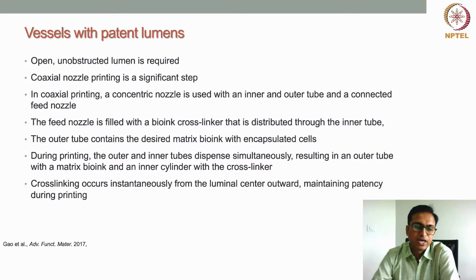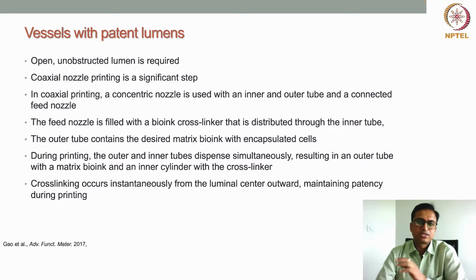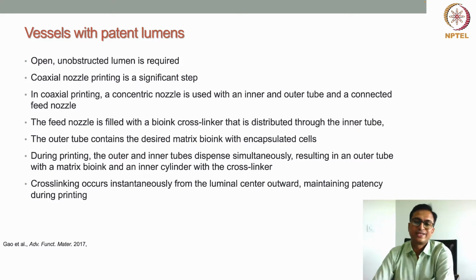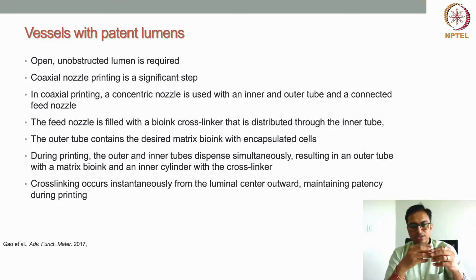But suppose I extrude the bioink through the outer channel, and through the inner core I pump or feed the crosslinking solution, then what will happen? The crosslinker will crosslink the bioink that is coming out as a tube-like structure, and inside it will be filled with the crosslinker.